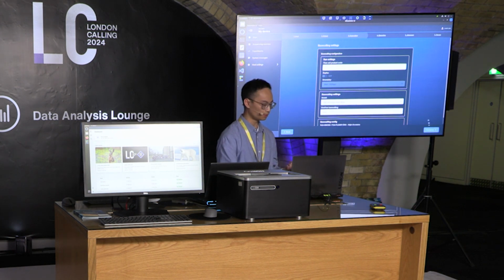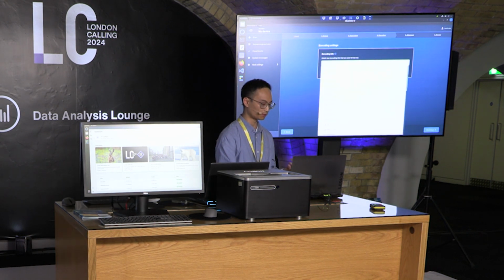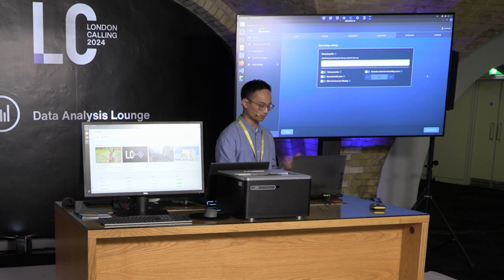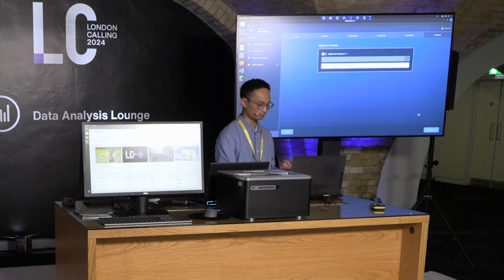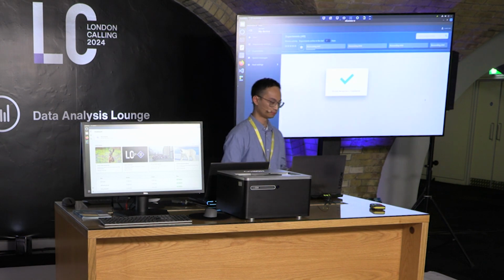We're going to click continue, and then we're going to indicate the barcoding kit, which is native barcoding. Also going to turn on barcode trimming for the convenience. And then once we're happy with all the settings, we're going to start the base calling process. Okay.